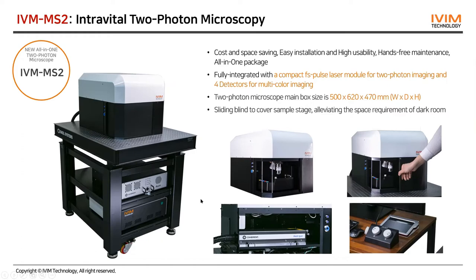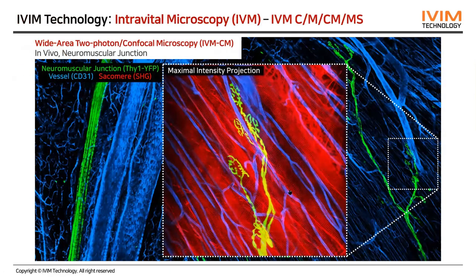And is it also possible, if people wanted to image tissue or thick tissue sections, to modify it so we can look at that using 2-photon as well? Oh yeah, of course. We have the standard slide glass holder as well.